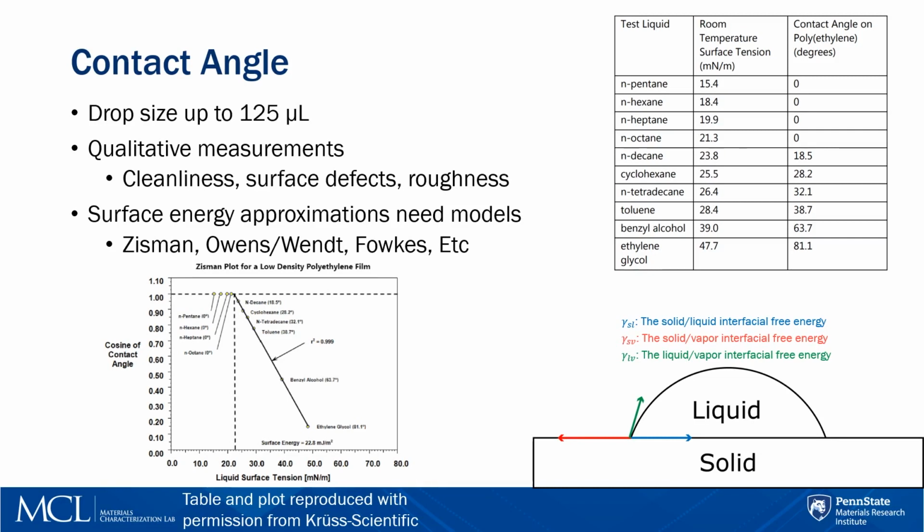What I just described could be very useful, however, for qualitative measurements, where typical contact angles are known for a certain liquid on a certain solid that has undergone a polishing or been etched or some other treatment. Let's use the example of plasma-treated graphene. If you know the typical contact angle for water on plasma-treated graphene, variations in the measured contact angle could help to identify when something has gone wrong in the synthesis or treatment steps.